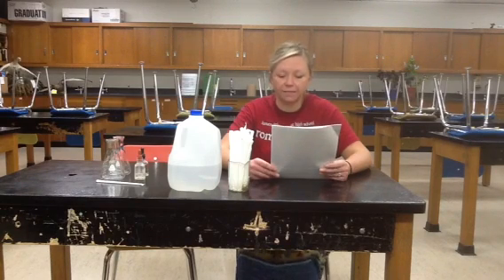All right, human respiration and gas exchange. Carbon dioxide is a byproduct of respiration, and it's produced at the same rate that oxygen is being consumed. Therefore, we can use carbon dioxide production as a measure of respiration. In this experiment, you will measure carbon dioxide concentrations by the use of the indicator phenolphthalein, which changes color from pink in a basic environment to colorless in an acidic environment. Carbon dioxide, when mixed with water, will form carbonic acid. As the carbon dioxide concentration in water increases, so does the amount of carbonic acid.